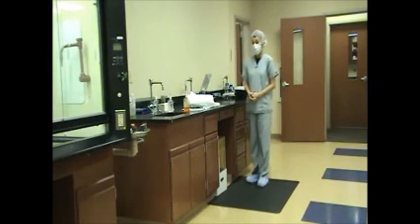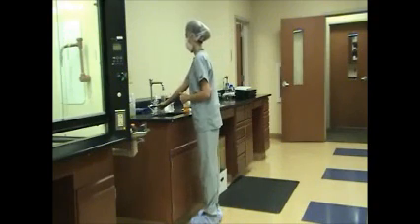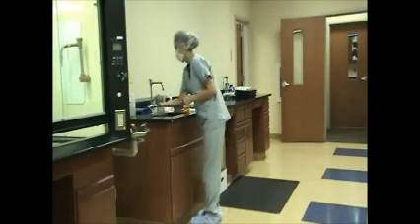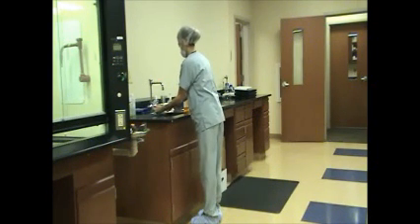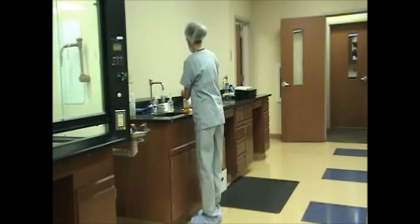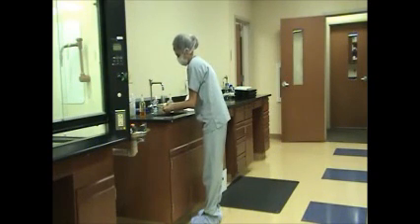Performs hand hygiene procedure by wetting hands and forearms and washing using soap and warm water. Scrubs hands starting with fingernails, first using appropriate scrubbing motion, cleans all four surfaces of each finger, and cleans all surfaces of hands.